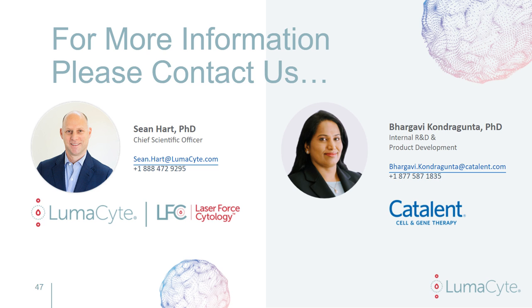They also had a follow-up noting that their viral system takes approximately 8 to 10 days to produce plaques. So how is Radiance able to detect infectivity sooner than traditional assays? Sure. For the plaque assay, as everyone's aware, that's sort of a final endpoint, right?